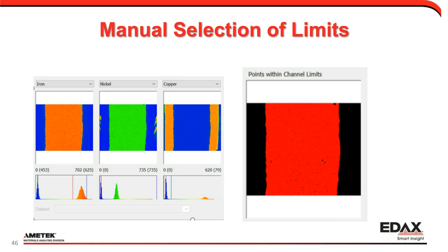It's just like the camera optimization settings. You can push a button and it automatically optimizes the camera for you. Sometimes it works great, but oftentimes I find I can do slightly better because I'm used to dealing with it. Same thing goes with Chl-Scan. You have the ability to use the optimize button, get done with it, and in the end just say, hey, ta-da, we're good. But sometimes it fails or just doesn't do quite the job you want. You can tweak the settings, or you can do it manually by again unclicking the box.